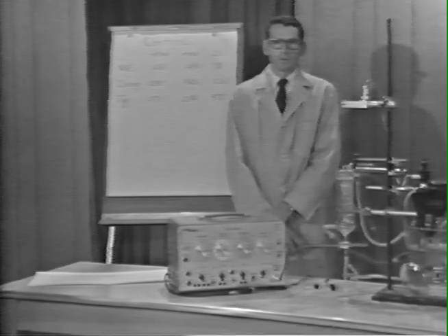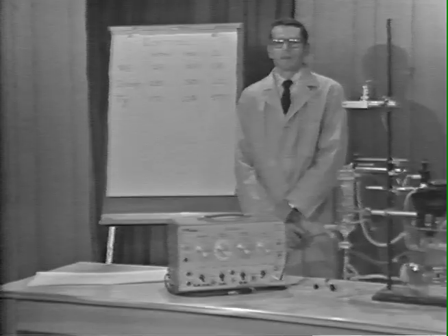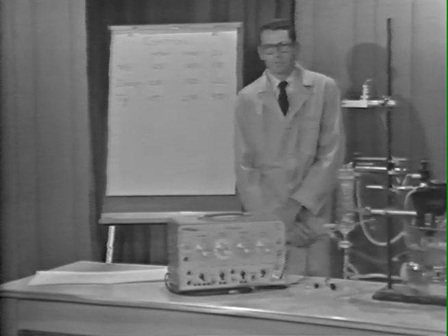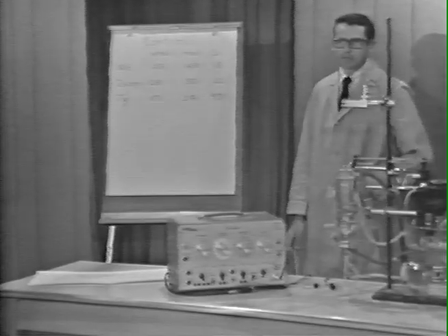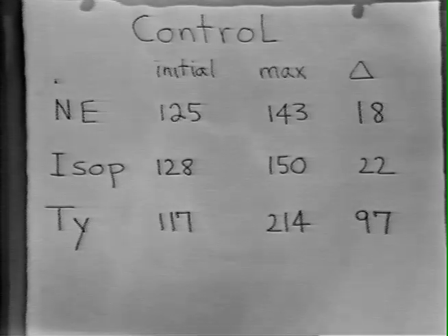We've obtained the response to tyramine, and we also went ahead and injected isoproterenol into the bath and obtained a response to this amine. We have the results of these 3 injections summarized on this chart. We can take a look at these and compare the responses.